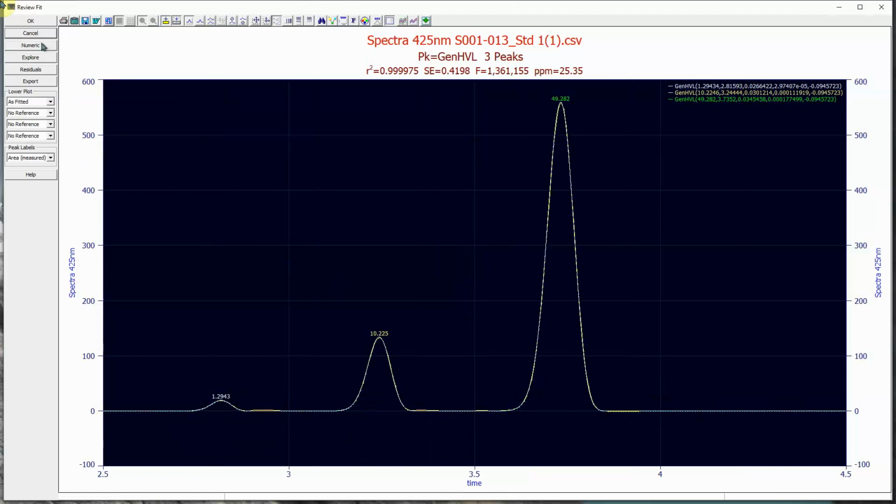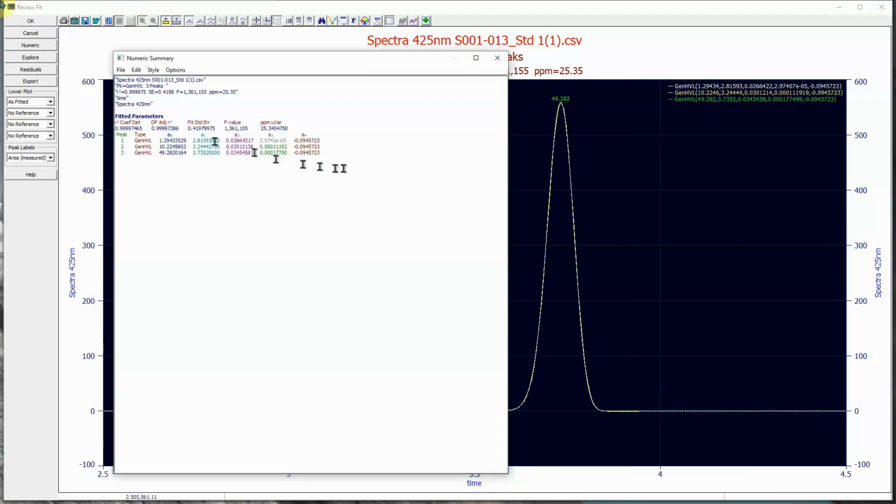So a superb fit, very little time, very, very good convergence on the fitting, virtually effortless, and that's the benefit of knowing what your instrument response function is prior to the fitting.